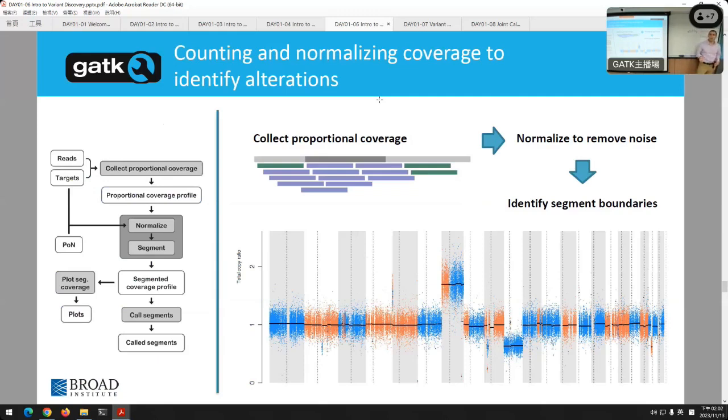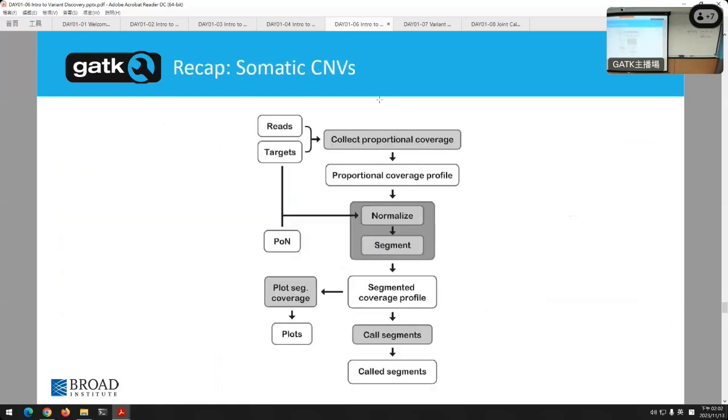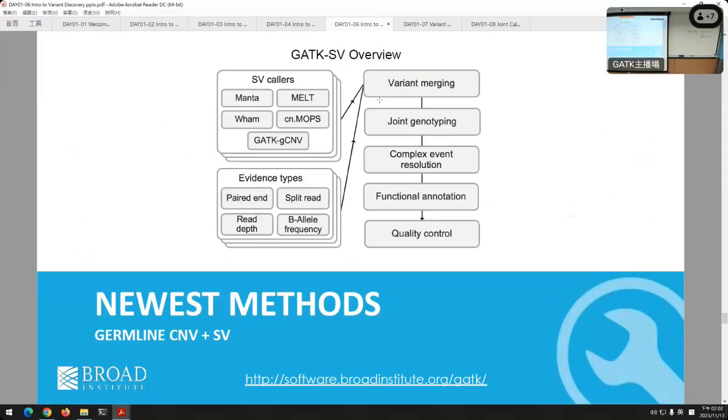So the Broad adds some extra for some exons that they like. They add some extra capture inside. So arbitrarily, the Broad is capturing differently than you do here in Taiwan. Okay, so all of that is very difficult, and we deal with that computationally. Okay, and we'll teach you all about this on Wednesday, all the processes and math and stats involved. Okay, and then on Thursday, you'll have Emma teach you our latest offering, which is now the structural variation.